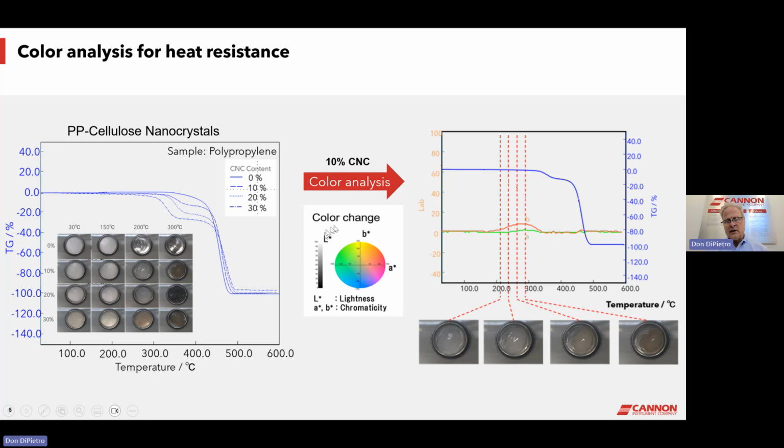What the apparatus does is it has a colored filter array on all of the pixels, so that array can actually report a light signal. And one traditional way of measuring light signal is an LAB scale. So in the case of the L, that's the intensity. In the case of the A, that's a scale that ranges between red and green. And the B scale would be in the positive direction, yellow, and the negative direction would be blue.